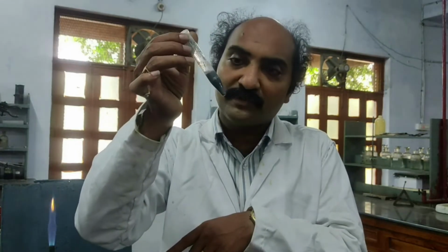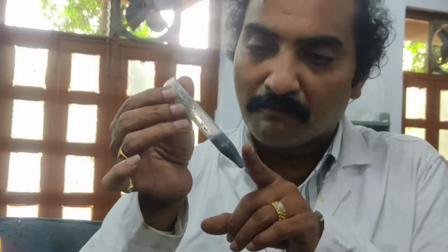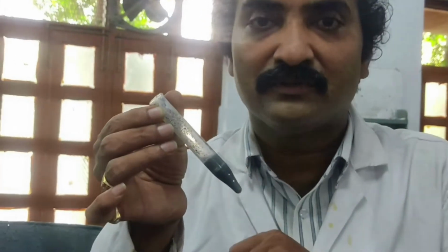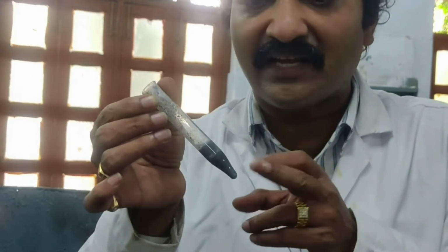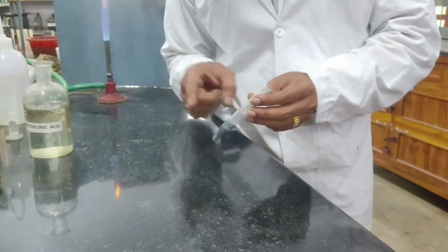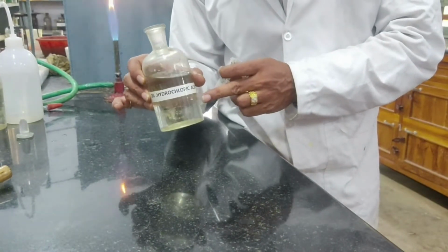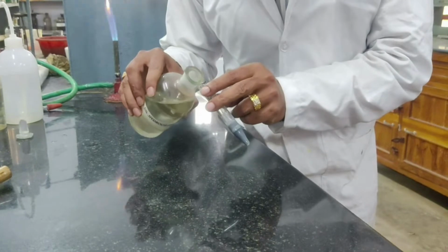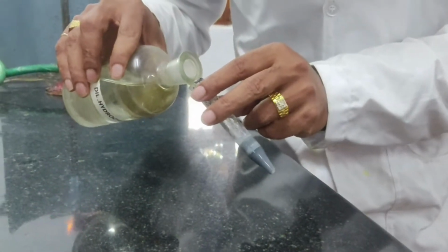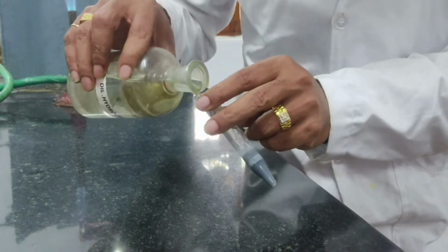If you observe this precipitate carefully, it is somewhat grayish, blackish in color. So it may be containing more than 1 cation. That is my observation by looking at the precipitate as of now. So let us check what are the actual cations present in this precipitate. To this residue, I have to add a little amount of dilute hydrochloric acid. So I have taken dilute hydrochloric acid and I am adding it to the residue obtained for 4th group cations.